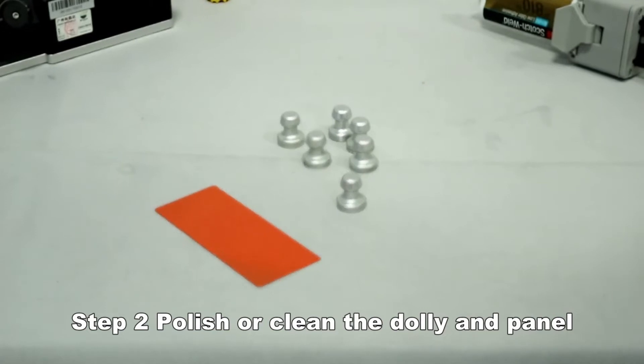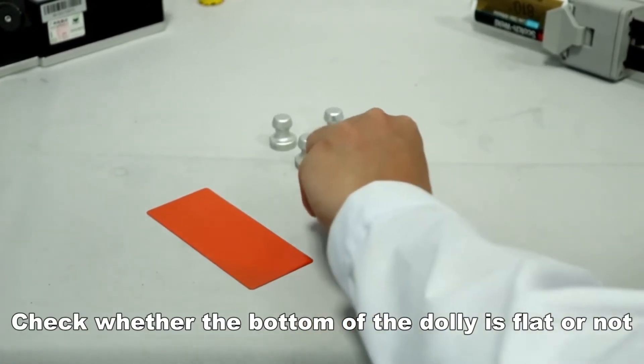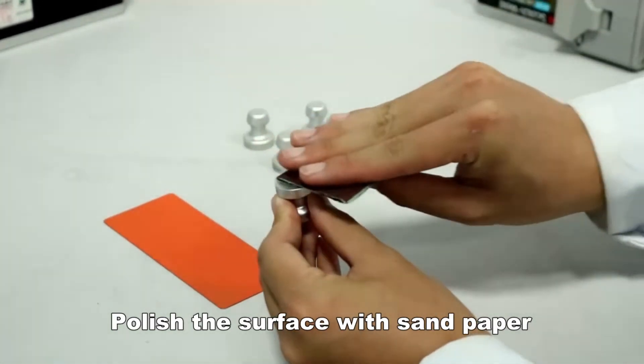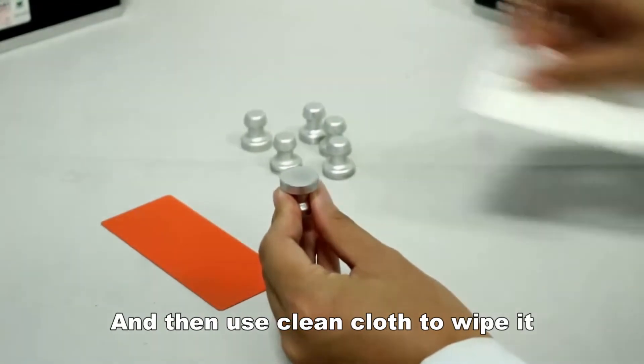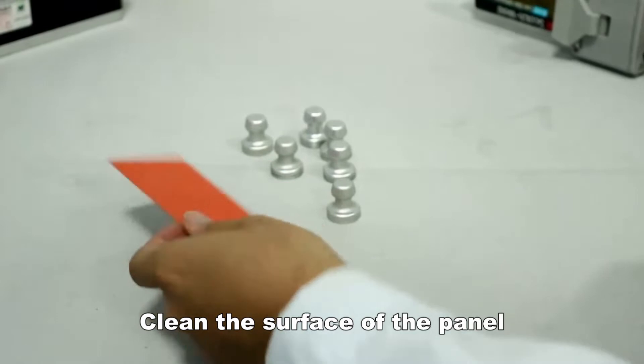Polish or clean the dolly and panel. Check whether the bottom of the dolly is flat or not. Polish the surface with sandpaper, and then use a clean cloth to wipe it. Clean the surface of the panel.